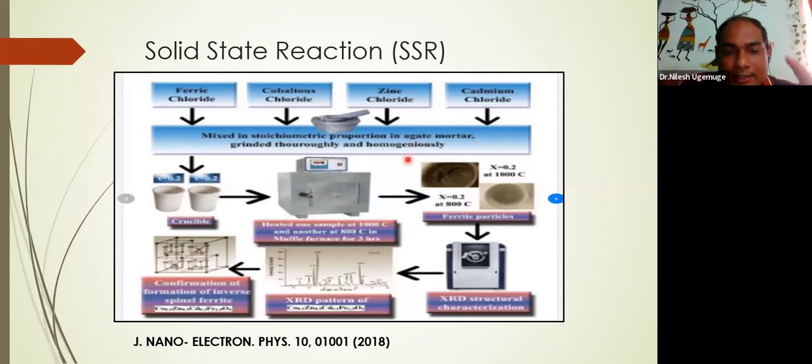So friends, to check whether YVO4 has formed or not, we can take the X-ray diffraction pattern, XRD, of that. We have the JCPDS data, Joint Committee for the Powder Diffraction Standards, and we match with that. If the 2 theta values and intensity peaks match, then definitely we can say that there is formation of YVO4 or any compound. And then we can carry out further study.